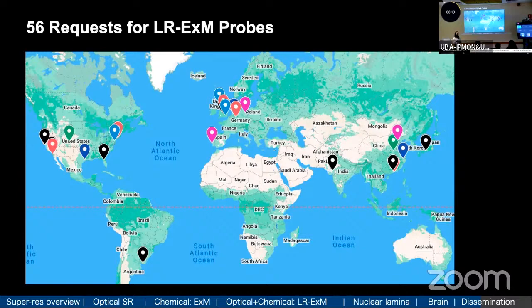And lastly, I want to talk about our dissemination project with Leona and a few colleagues back home at UCI and in Japan. Our goal is first to fulfill the 56 requests from 2 years ago about our probes. So we scaled up our synthesis. We synthesized the trifunctional linkers in our own lab. And special thanks to our chemist sitting at the end of the room, Zhipeng, for scaling up in our lab.